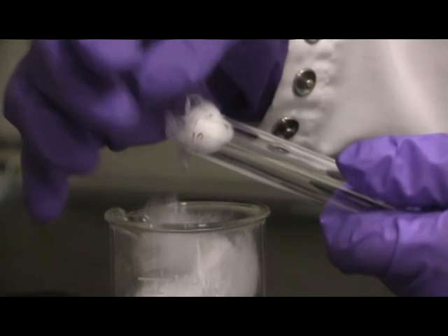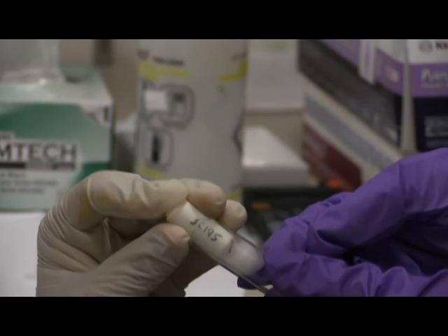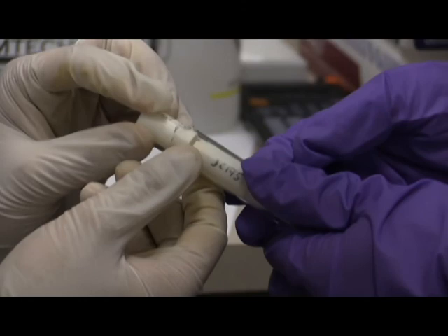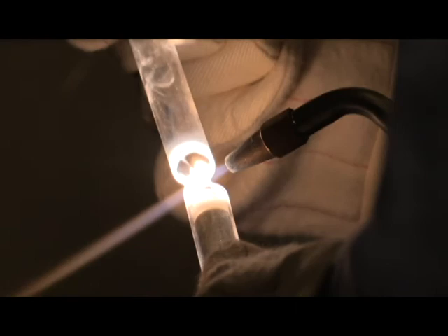Quartz wool insulates the tube and protects the crystal. The crucible enters the tube and is pushed to the bottom. A thin neck is made in the tube, directly above the crucible.